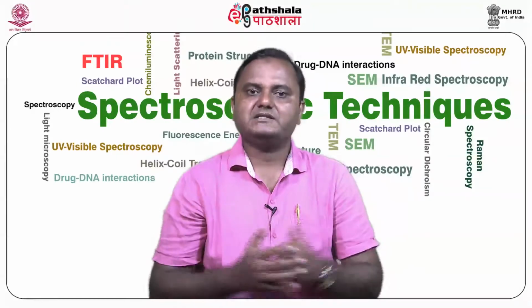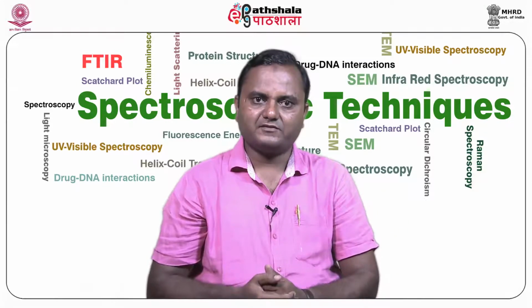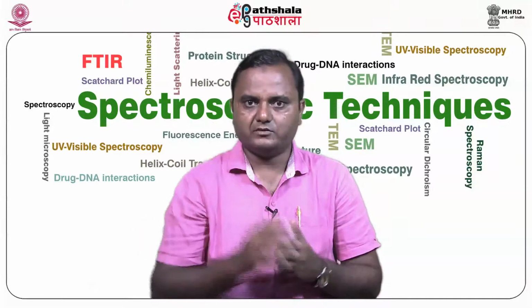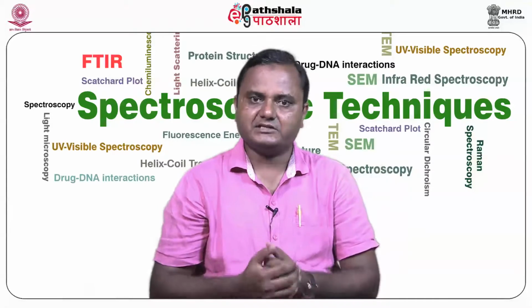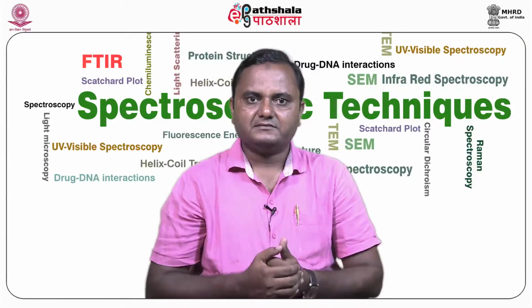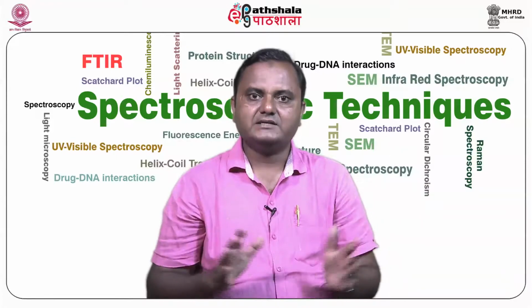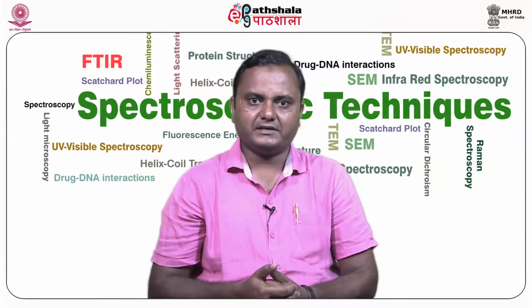And the fourth one is the multi-angle light scatterer, which measures the intensity of light scattered at multiple angles and extrapolates back to 0. Measuring at multiple angles can increase the confidence in the data. Angles can be removed if required. It measures the molecular weight for molecules of all sizes. Not only this, it also measures the Rg for molecules bigger than 15 nanometers.